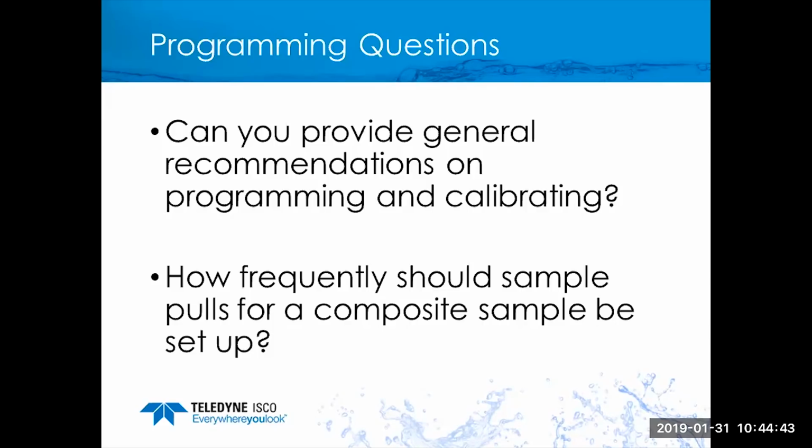And as indicated above, 96 samples on an average day. If I'm doing flow-paced samples, I will devise a program to meet that target. But that's not an absolute need. Those are just my rules of thumb. That certainly can vary from application to application, as well as with particular requirements that have been established by whatever entity is dictating the need to collect samples in the first place.